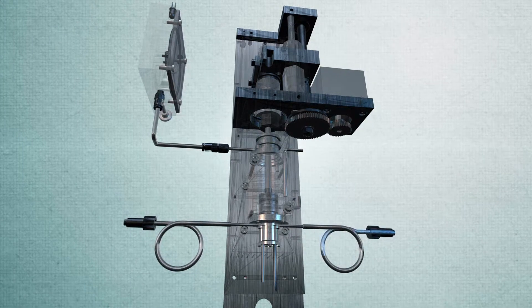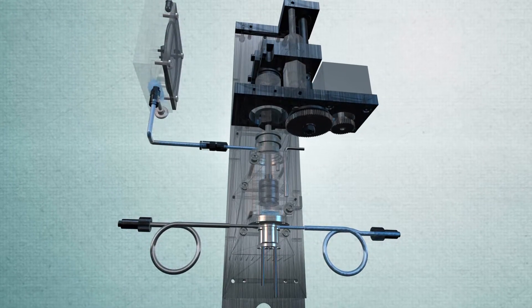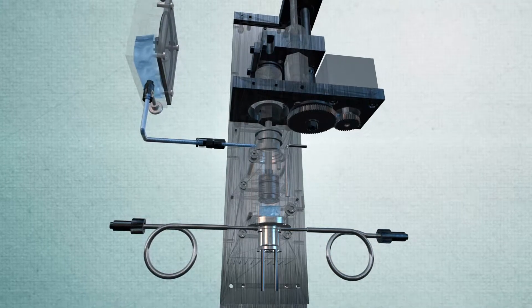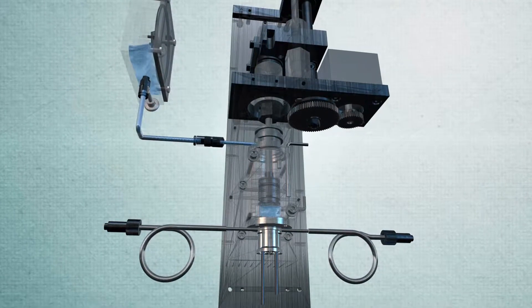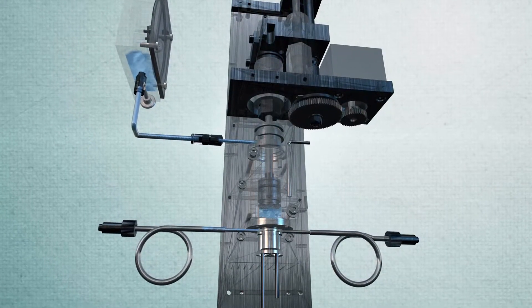High quality valves minimize cross-contamination during tests. Central lubrication makes the analyzer maintenance free. For fast equilibrium, a shaker is installed in every unit.